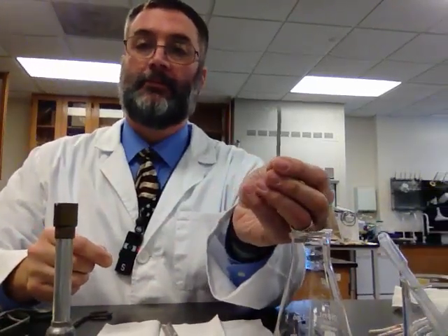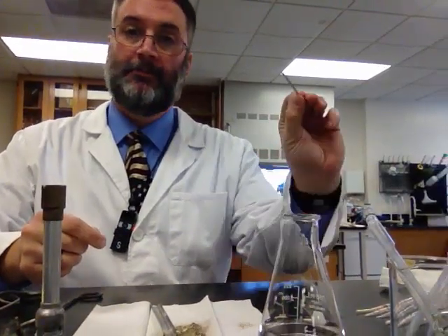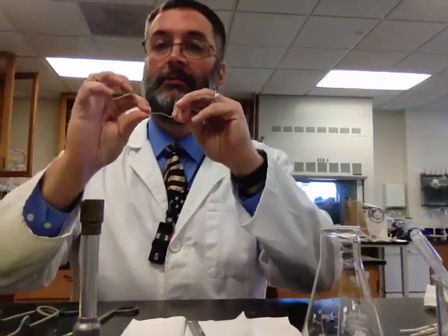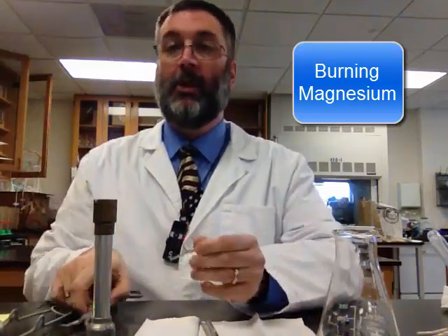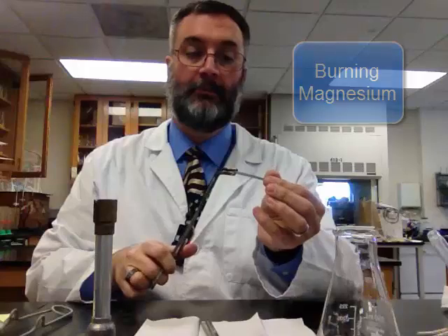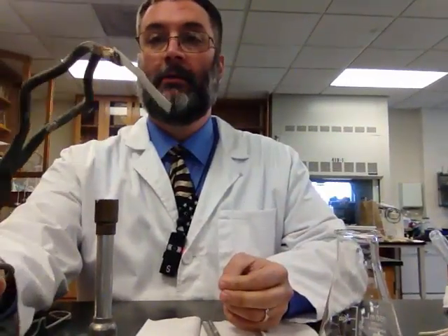Number 3. I have here a piece of magnesium metal. It comes in a ribbon. It's malleable, doesn't break, slightly shiny. It has a bit of a patina on it. I'm going to hold this piece of magnesium, shiny, grayish silver, bendy, in the Bunsen burner flame. Now you want to be careful, and this is going to be very bright. You'll see in just a second.